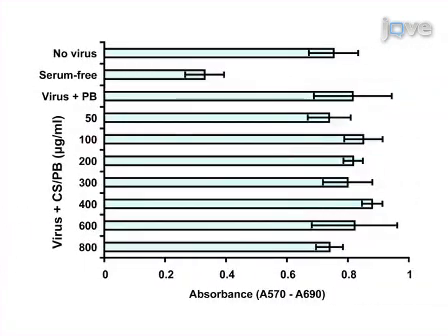The MTT viability assay allows sensitive detection of growth arrest in target cells. As seen here, transduction with virus plus concentrations of chondroitin sulfate polybrene up to 800 micrograms per milliliter have no effect on HDF metabolism.